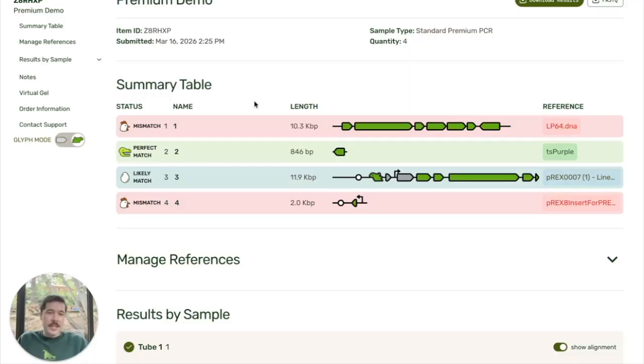And so you can see three different possibilities. You can see that if it matches very well, we get this perfect match, that's denoted by this happy looking dinosaur. If you've got one or more mismatches, you get the dreaded chicken. And we've also got this egg denoting a likely match, and there'll be more on that in just a moment.